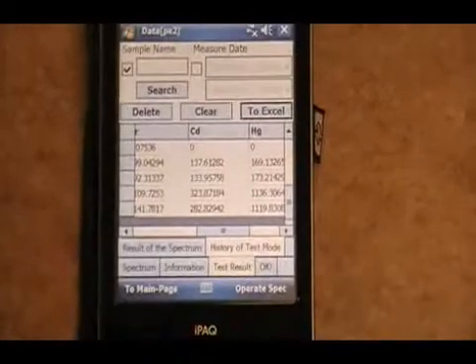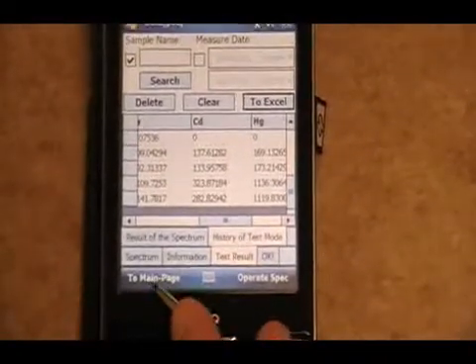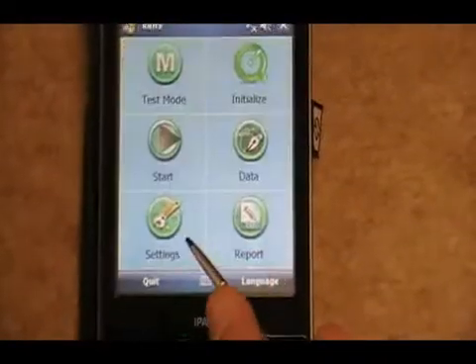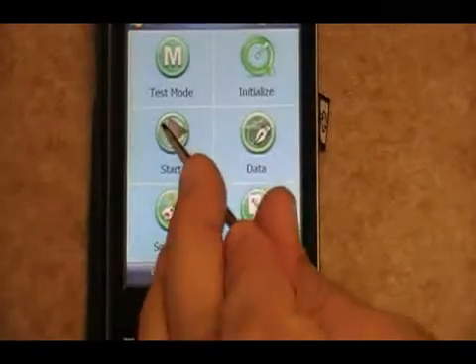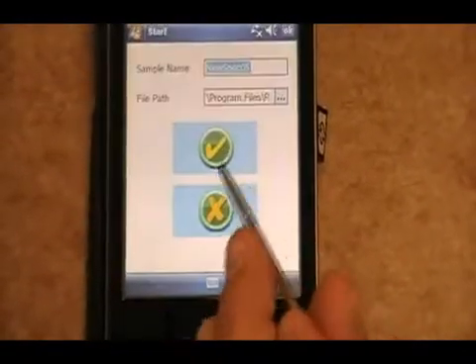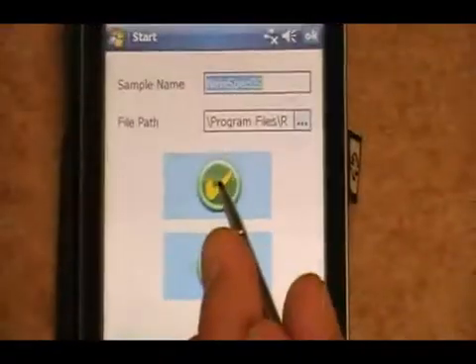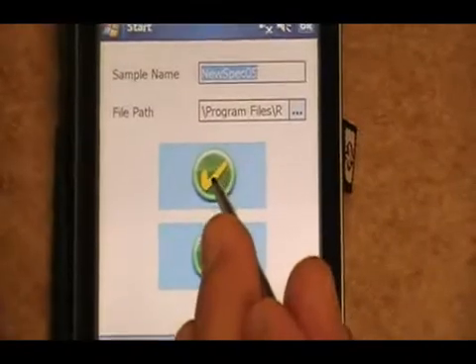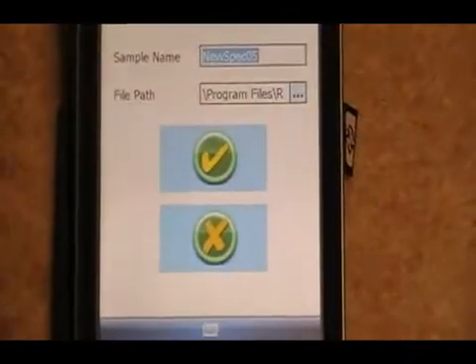So to review how to run, we'll go back to the main page. We'll do our PE high. Simply hit the start key. Name it if you need to name it. Hit the check mark for OK.